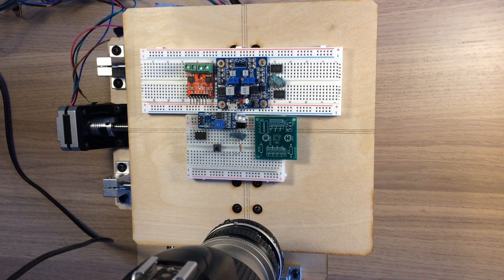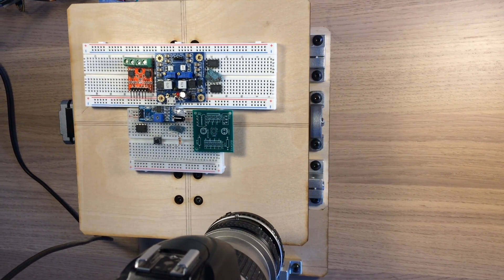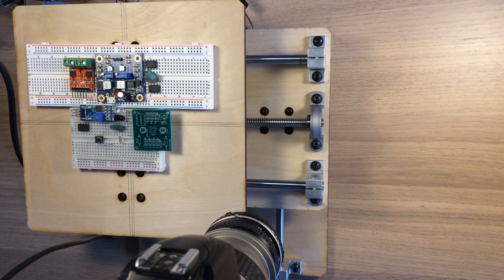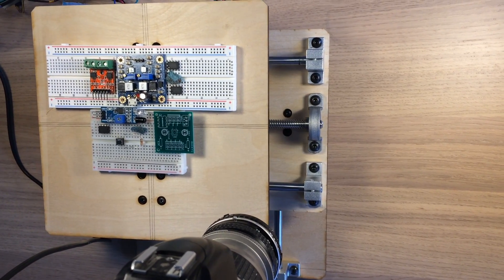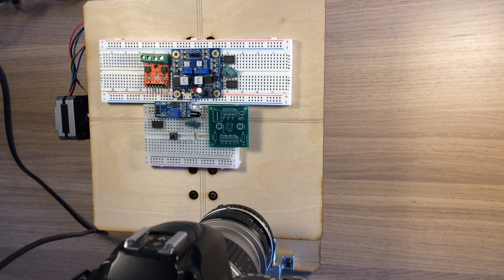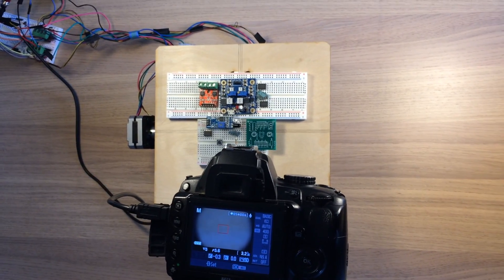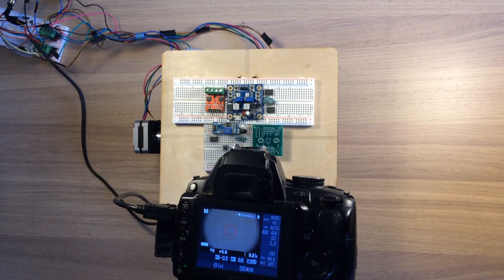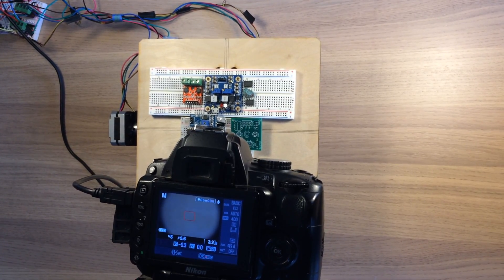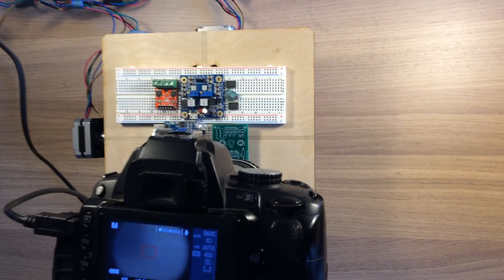Here is a video of my desktop gigapixel microscope in action. The basic idea is to stitch together many high resolution images to form a large field of view. In these images you get to see both the full sample as well as fine detail in any portion of the sample. The result is an image consisting of about 1 billion pixels, much larger in comparison to the pictures taken by a DSLR or smartphone which typically have around 10 to 50 million pixels.